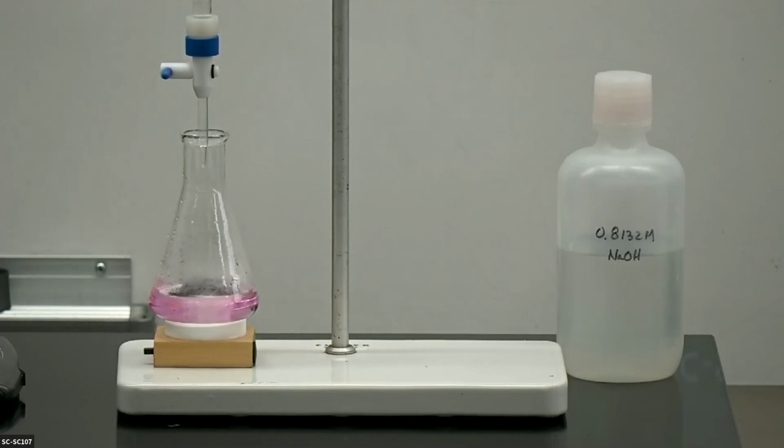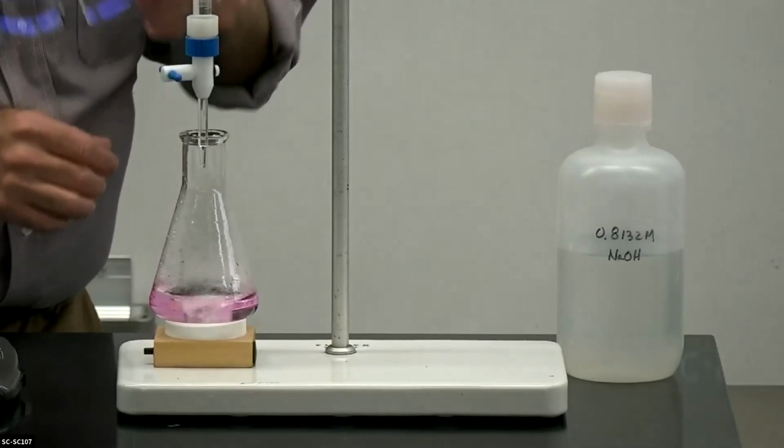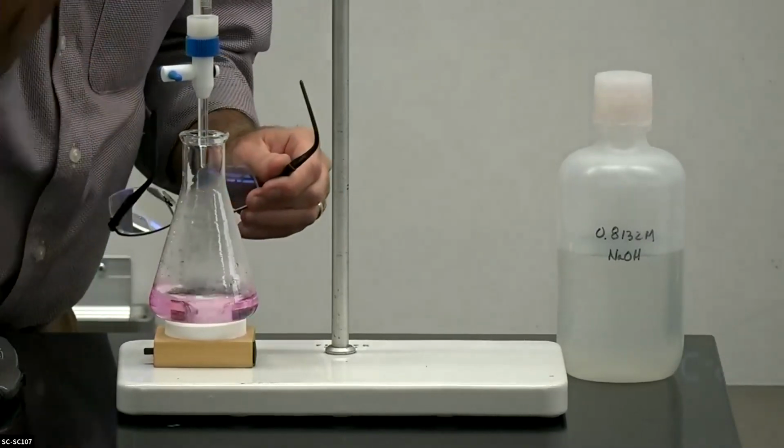Now you want to let it sit for a little bit just to make sure the pink color stays put, that there isn't some sort of mixing that still needs to happen to get to some of the vinegar that might be present. But once it stays pink, you can check the final volume. Final volume here is 26.60.